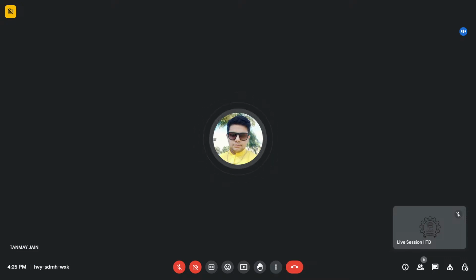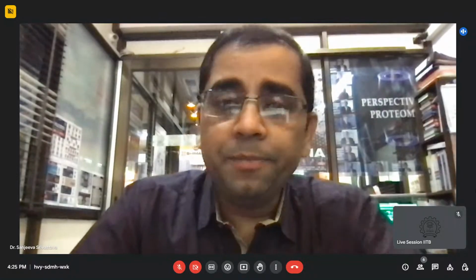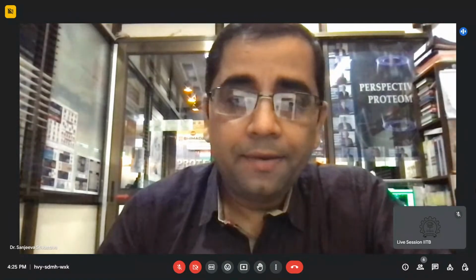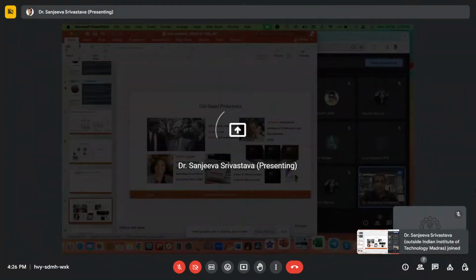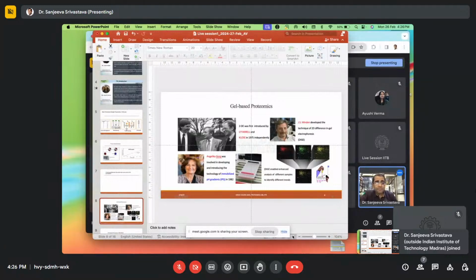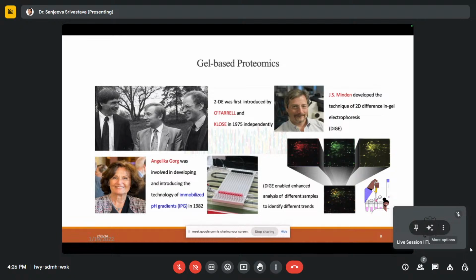All right, thank you, Amrita. So before we go to the next step, let me just give a short overview of gel-based proteomics. And the idea is whatever you want to do in proteomics at different stages, you have to be familiar with the gels, right? And I'm sure many students who are watching us live and who are taking the course have already understood the importance of various types of gel-based proteomic platforms.